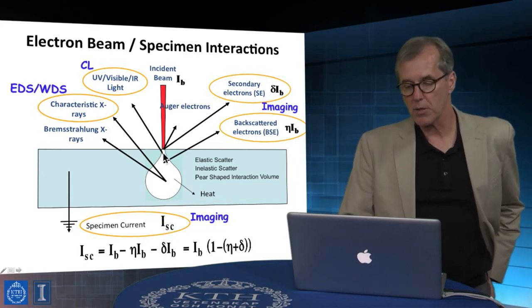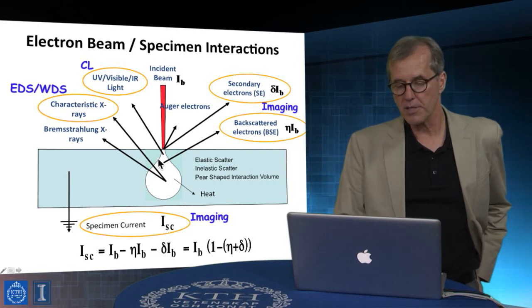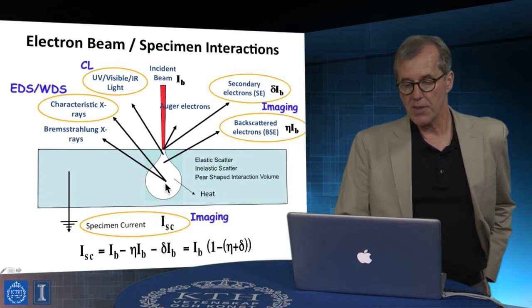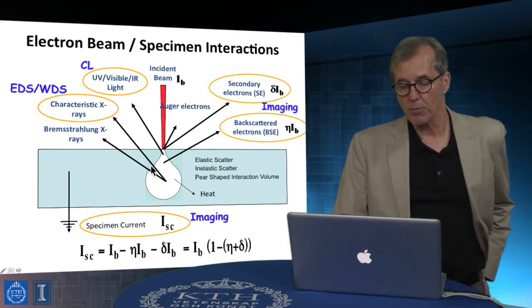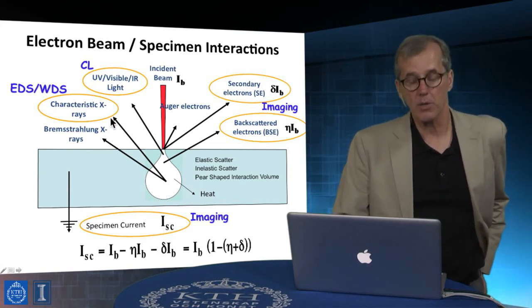Okay. The other part that's important to understand here is that in the energy range being used, there's also the possibility of electron excitations that lead to the emission of light, photons. These can be very broadly distributed across the X-ray wavelength region, and we've seen that in earlier slides.